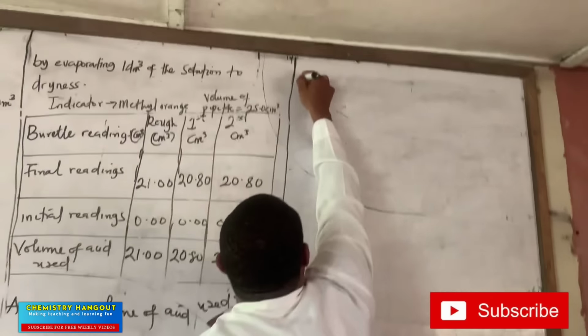So the normal formula for amount in moles is concentration times volume. If this is in dm³, now I'm not supposed to divide again. But most times it's always in centimeter cube because of the way our burette is being calibrated. So that's why I'm dividing like this. So the amount is now going to be, so what is the concentration? I've gotten that already. 0.0790 times what is the volume? This is the volume. 20.80 divided by 1000.